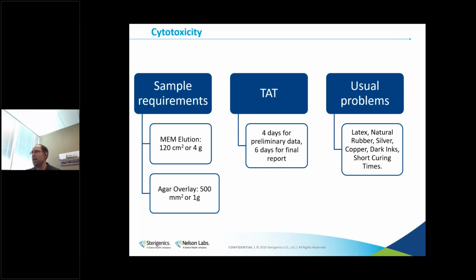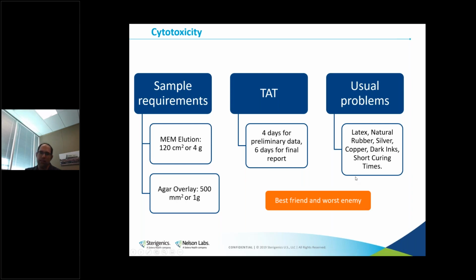So just to keep that in mind, I call cytotox your best friend and your worst enemy because it is so cheap and quick, but it's also incredibly sensitive. And not all the failures actually contribute to a true toxicity to the patient. So when you're doing this test, just keep that in mind.